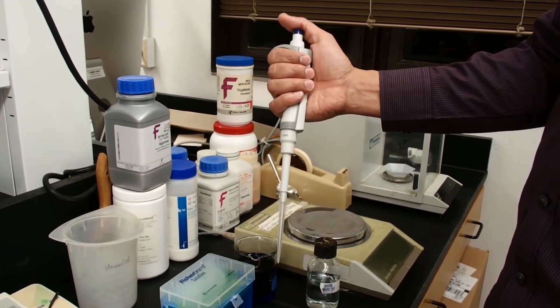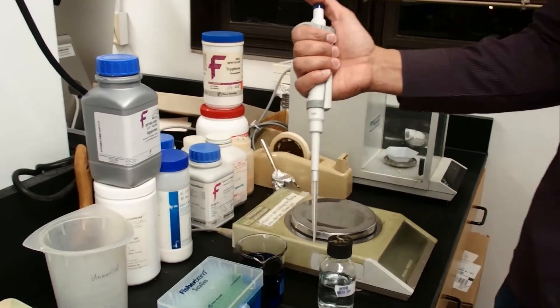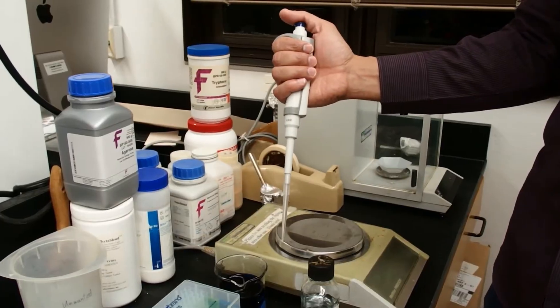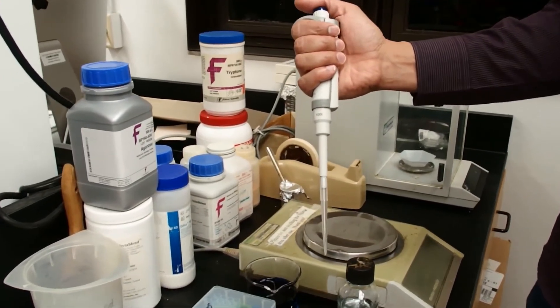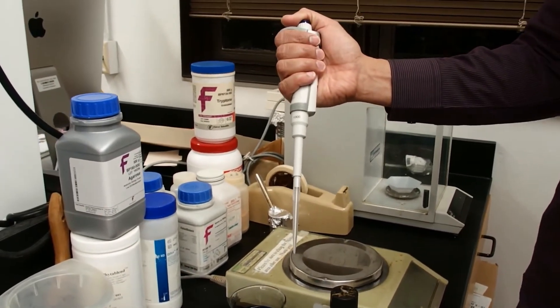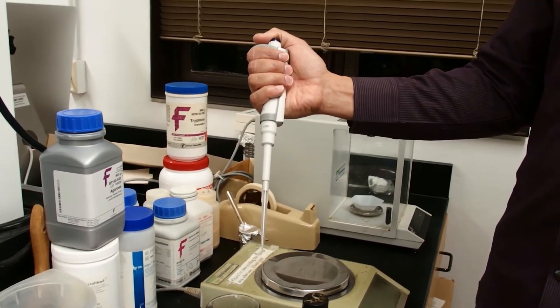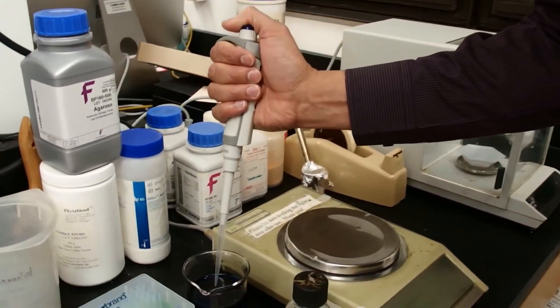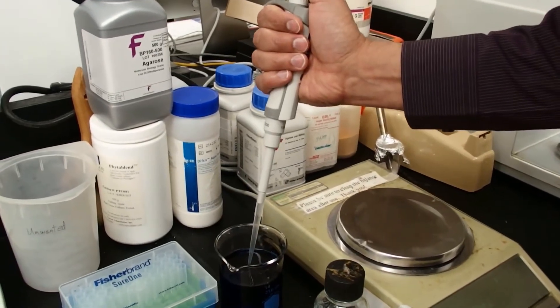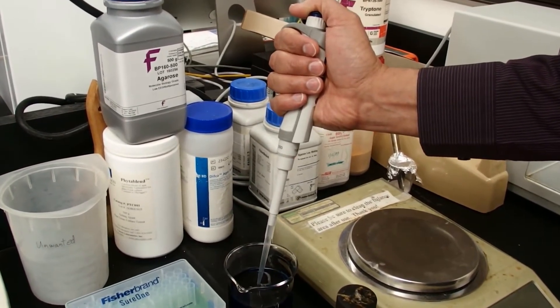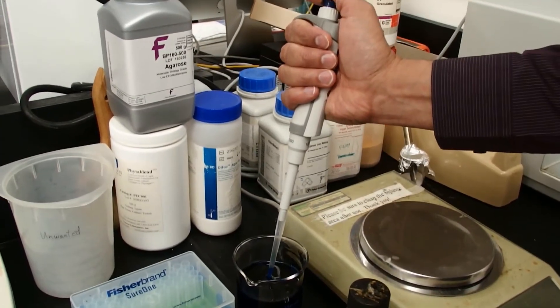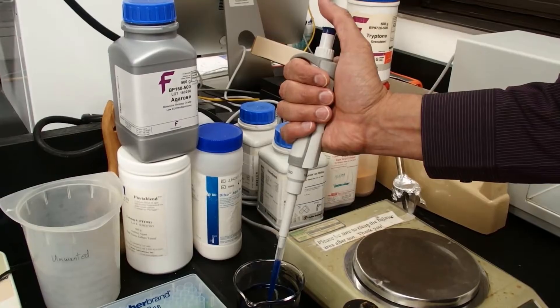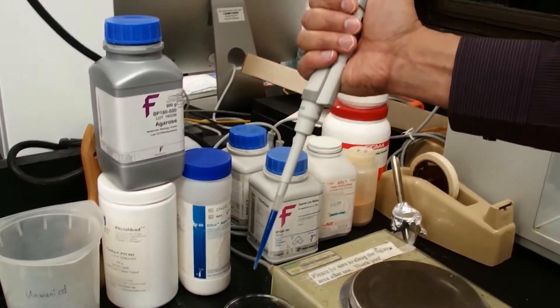I'm going to pipette 1,000 microliters of this blue colored water by pressing to the first stop in the air. It's important to do this in the air and hold. Then place it very shallow into the liquid, maybe 2 or 3 millimeters. Then release the plunger slowly. It's important to go slow to be accurate, and then take the liquid out.